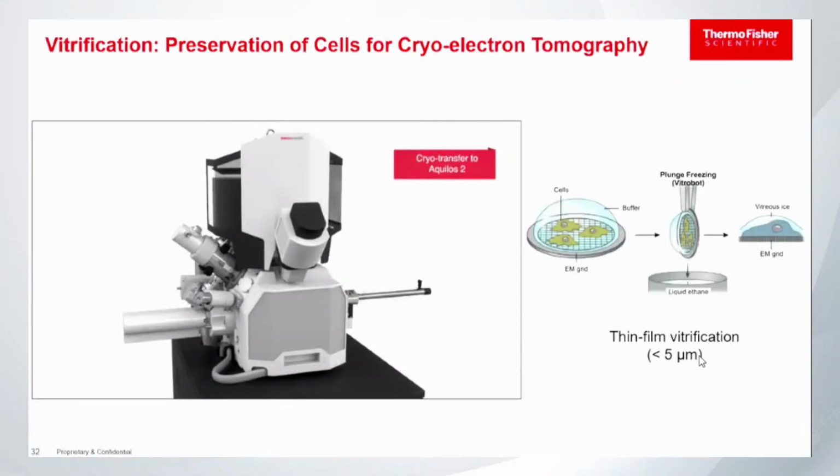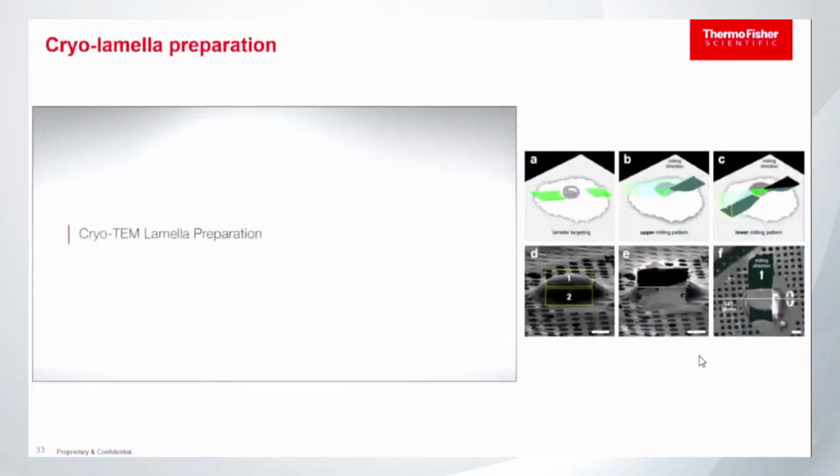After that, you need to go to the cryo-FIB SEM. And this is the typical instrument, the cryo-FIB SEM. So this is how it works to prepare the lamella.